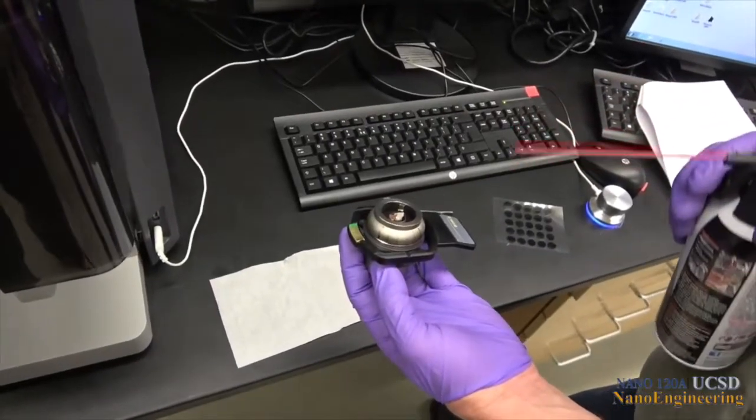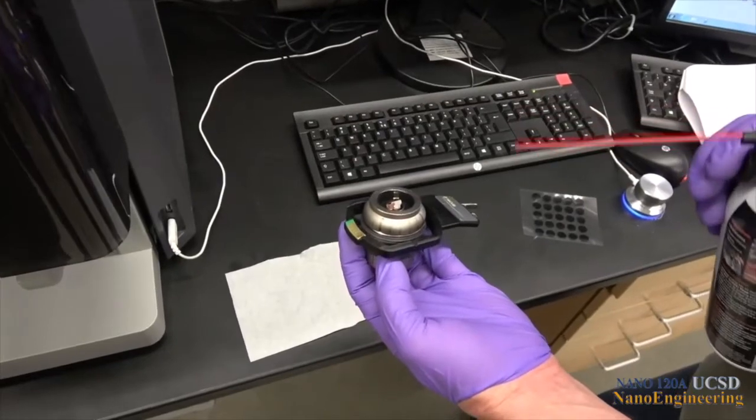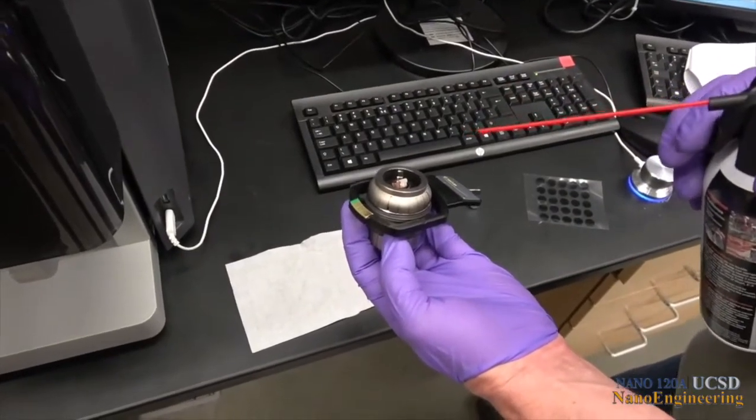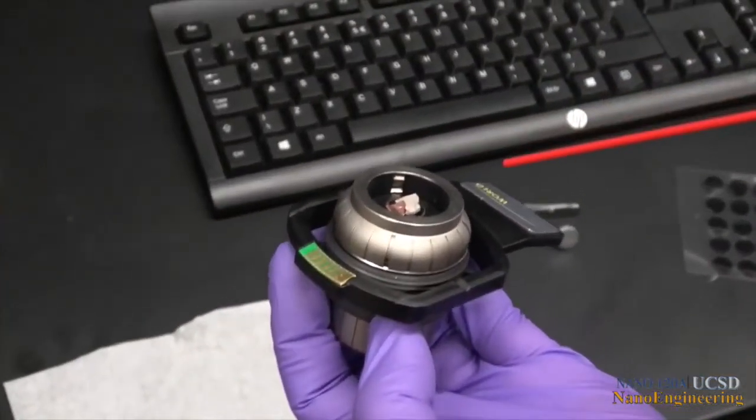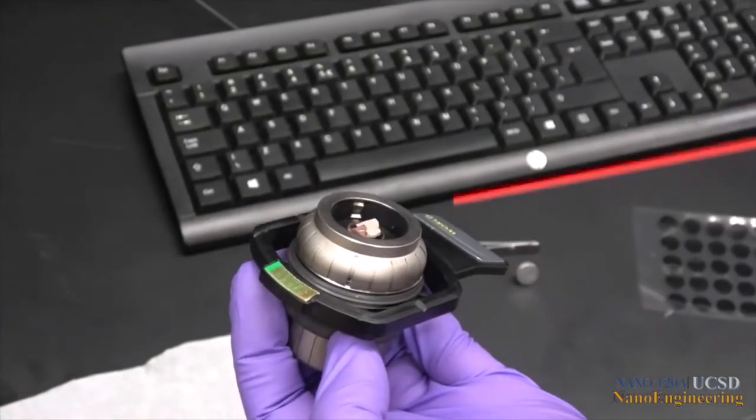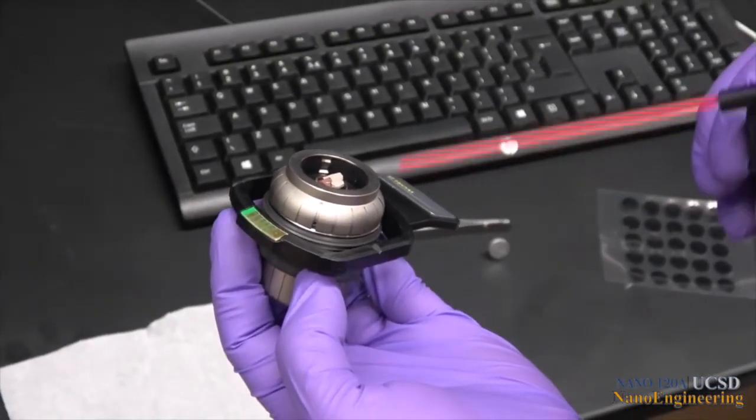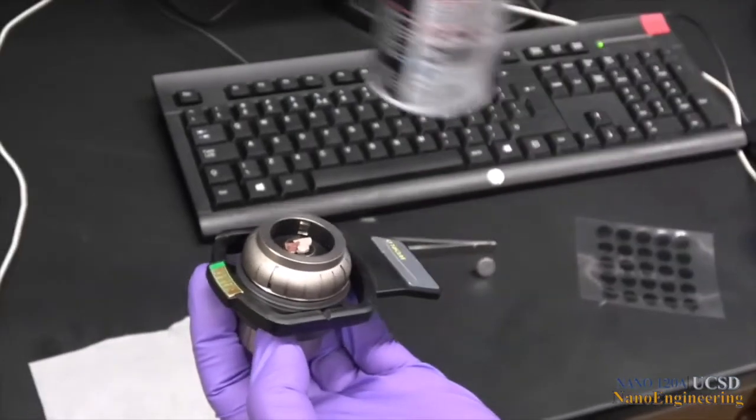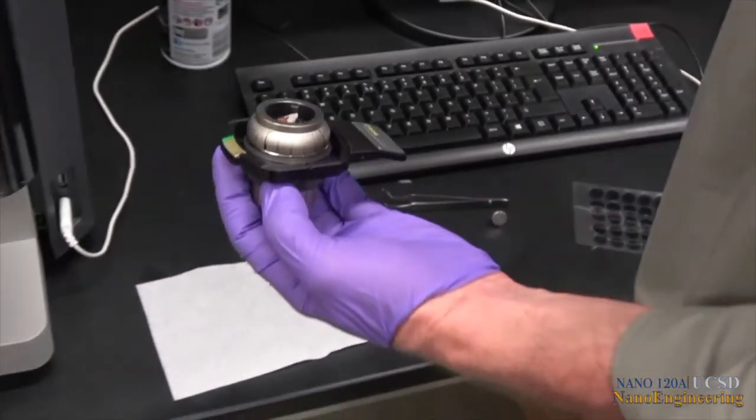Give the sample a light dust off to remove loose particles so they don't contaminate the chamber. This is especially important when examining powder specimens. Insert the sample holder into the slot shown until it stops, then shut the chamber door.